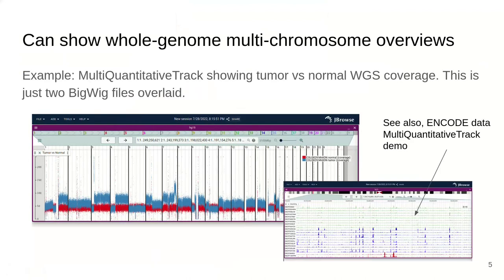We can also in JBrowse2 show whole genome overviews. This example shows a multi-quantitative track which has tumor and normal whole genome sequencing data, showing that the blue — the tumor sequencing — has amplifications and deletions throughout the genome. You can also see another multi-quantitative track example in the bottom right showing ENCODE data with different groups in different colors.